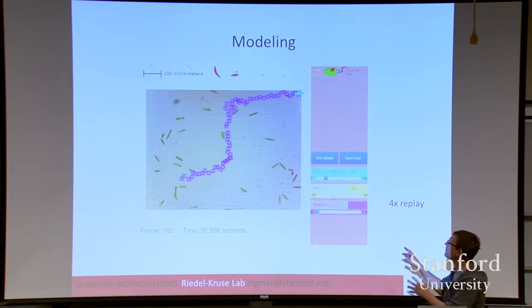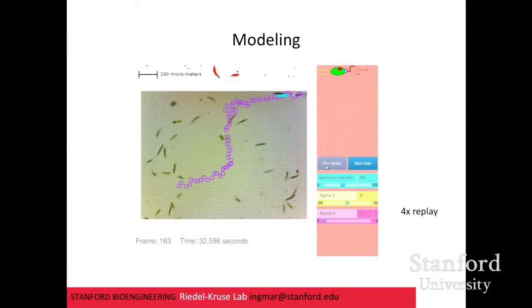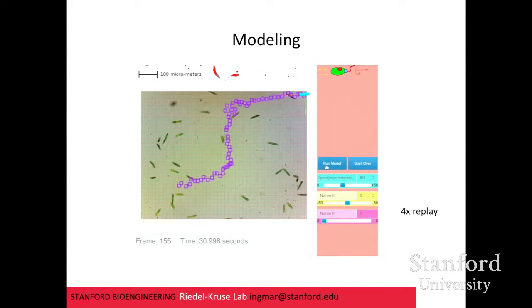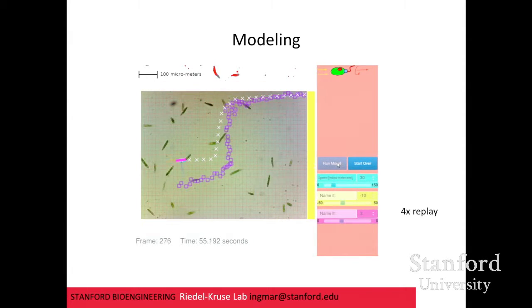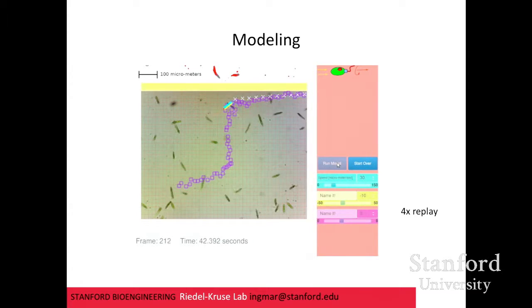If you choose these 3 parameters correctly, then you get a path that looks pretty similar like this, right? Students engage in discussions, and really to emphasize, these organisms just have one eye spot, so they can only sense light from one direction. What they need to do is roll around the axis to explore the 3D space. That also leads to these undulating motions, like this tumbling motion. So the students were doing this and discussing, comparing the experiment they've done and the modeling side by side.